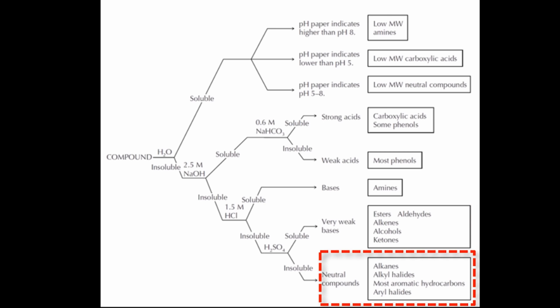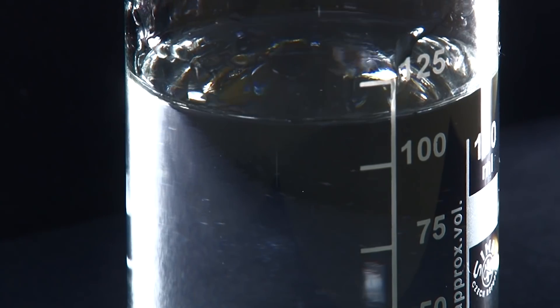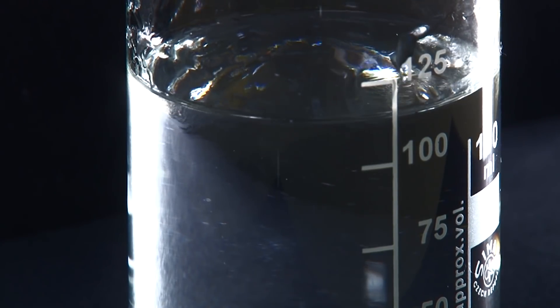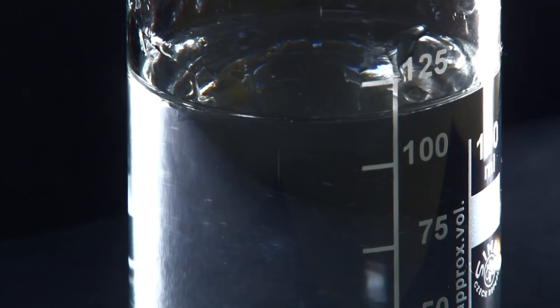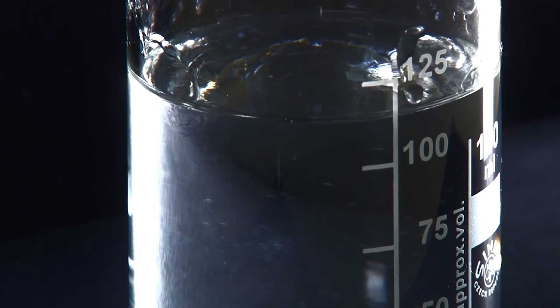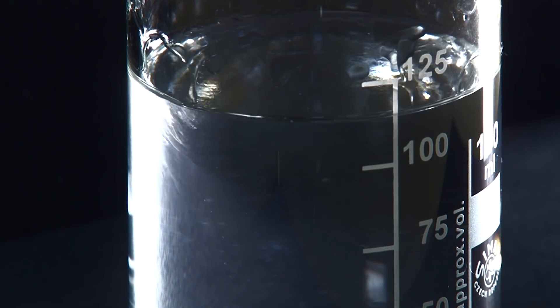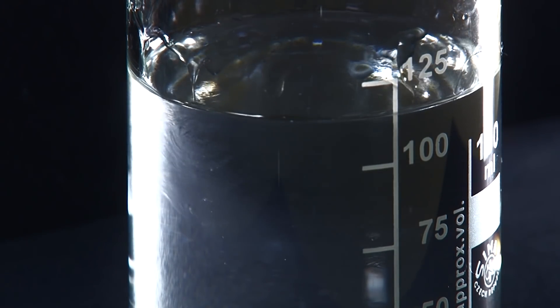Many organic compounds aren't soluble at all, however. Quite often it's difficult to see if two clear liquids are dissolving or not, so look for mixing lines like these ones that you see here. Even if all of the substance doesn't dissolve, the presence of these mixing lines will tell you that it's at least partially soluble.